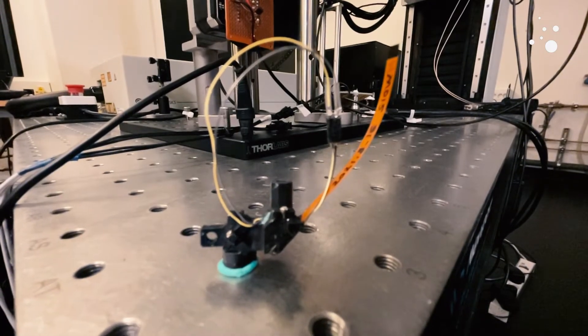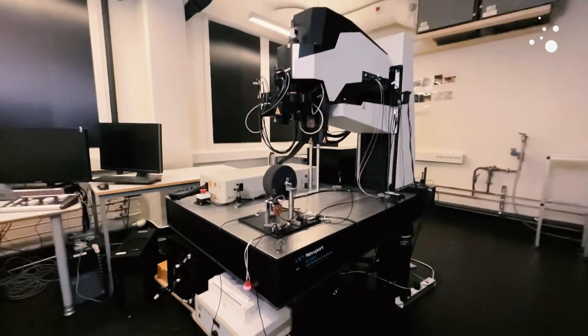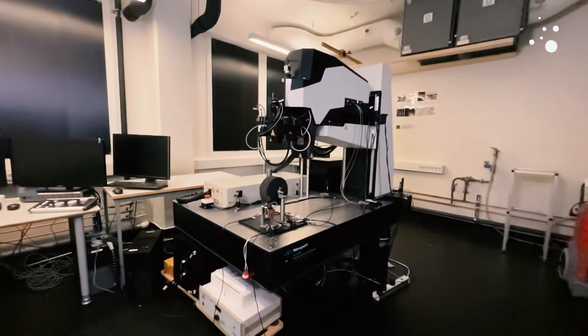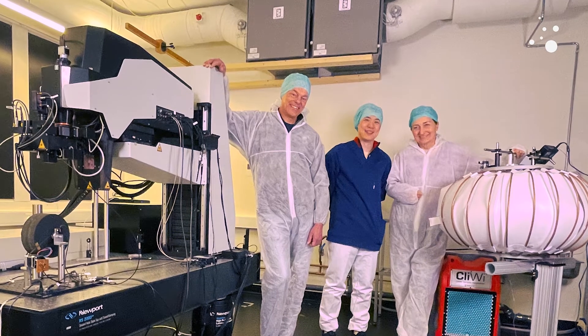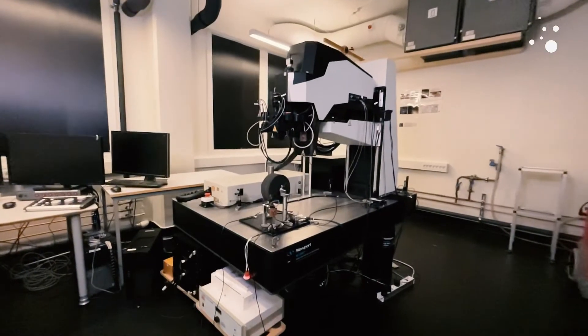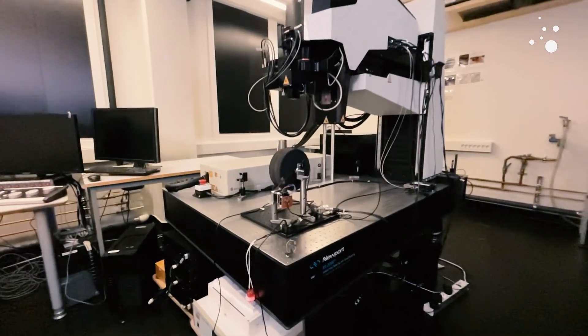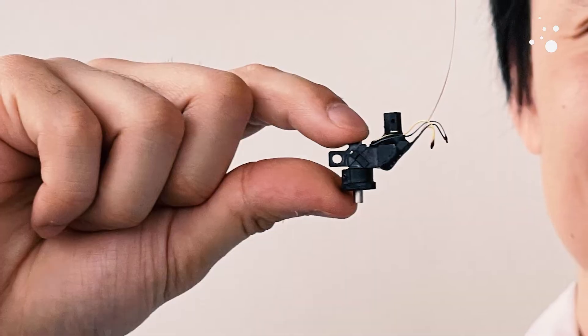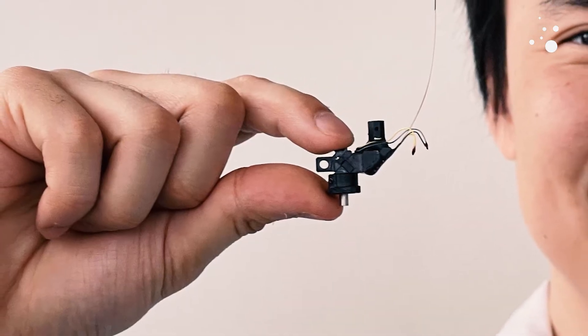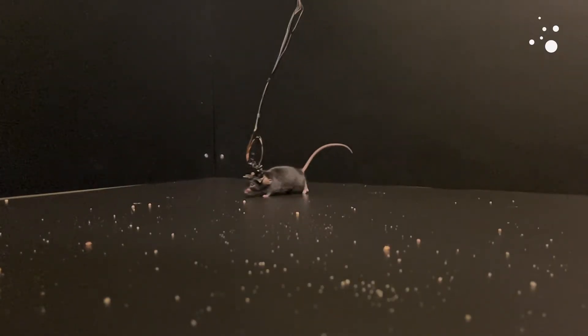So let's pit Mini2P against the closest existing technologies. This is a benchtop 2-photon microscope. It weighs half a ton and takes up nearly the whole room. The benchtop microscope restricts the mouse's natural movement that's nothing like a mouse would normally experience, which means its behavior probably isn't natural either. Mini2P, on the other hand, weighs 2.4 grams and allows the mouse to move just as freely and dynamically as it would without carrying a Mini2P on its head.